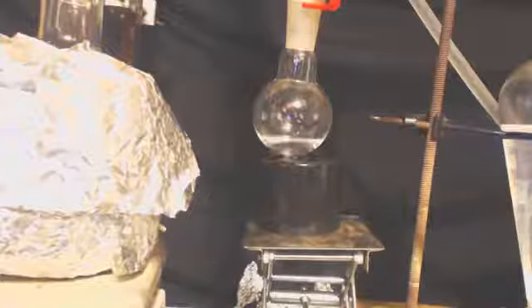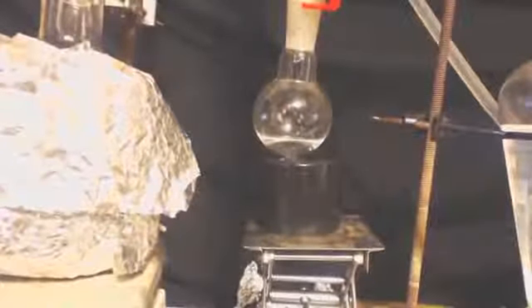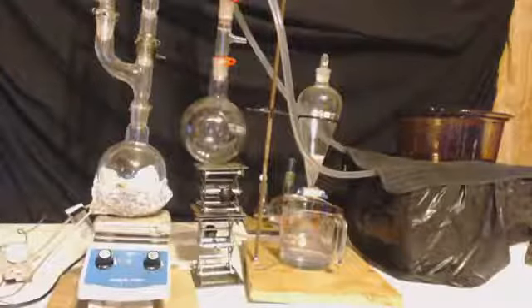You can see I got about, that's a 100 milliliter round bottom flask, I got about 30 milliliters out of there. So everything that's in that pot now is, because once it went past 90, it shot straight up to 106, and then I turned it off. I moved everything down before it went to 110. And so I got everything out of there except for the toluene and higher boiling point compounds.